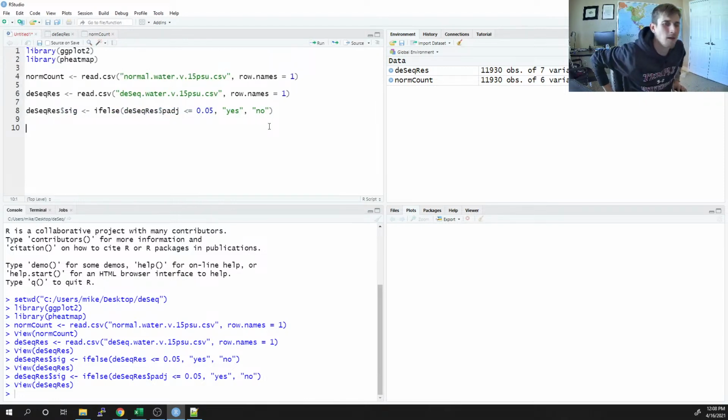I want this column basically for ggplot coloring, so I can color based off of significance. One plot that I can quickly make is the equivalent of a plotMA. That's where we plot the base mean on the X, the fold change on the Y, and then label whether the p-value was significant or not. That's not really bad to reproduce in ggplot.